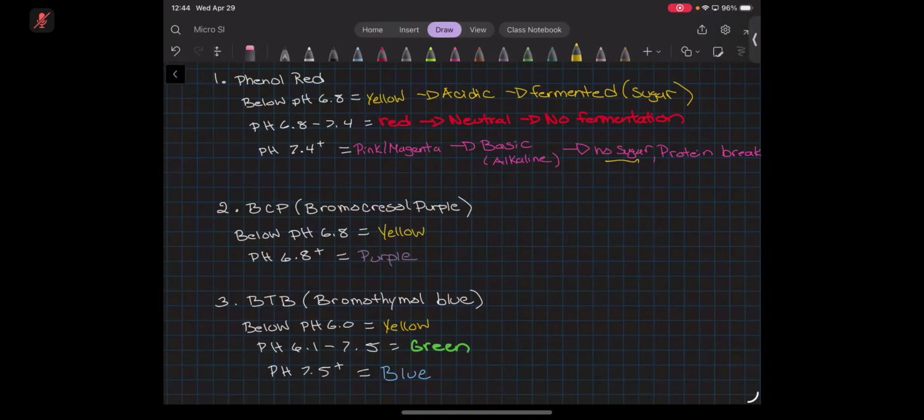This is the fermentation test though, right? When she's asking which test would be the fermentation test, she's gonna have all the tubes on there, and she's gonna ask you which one's which. But if she has a red broth.